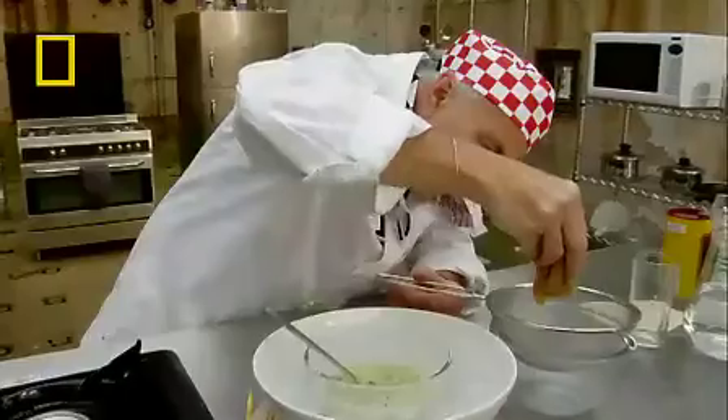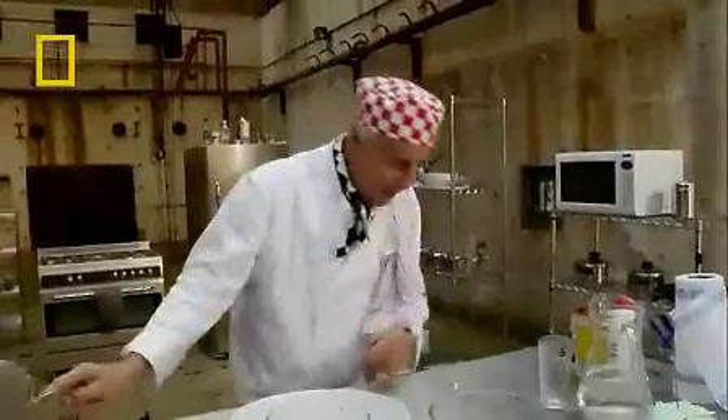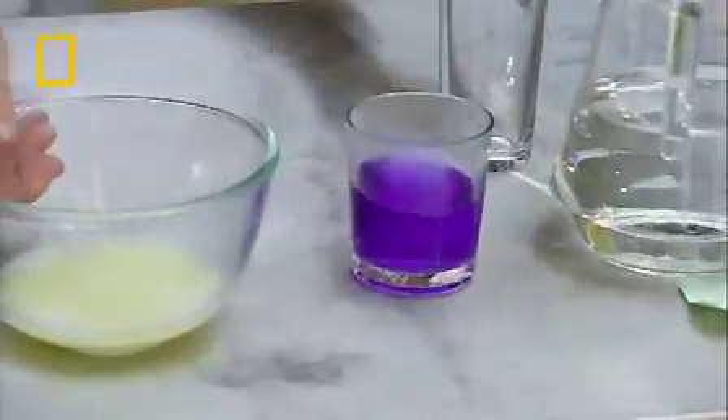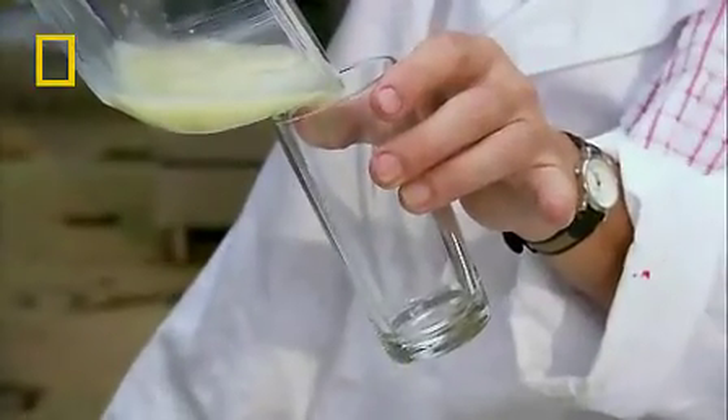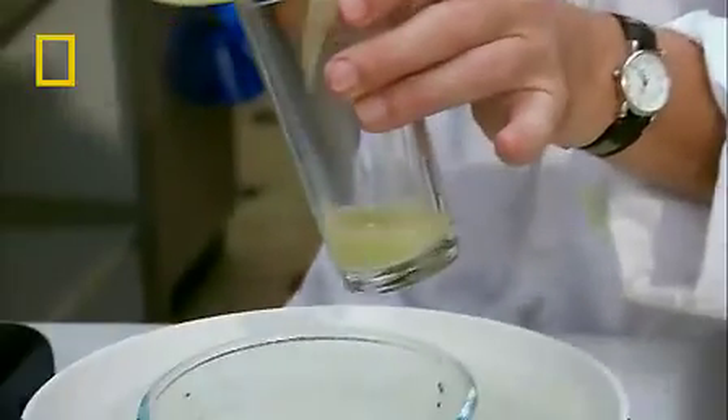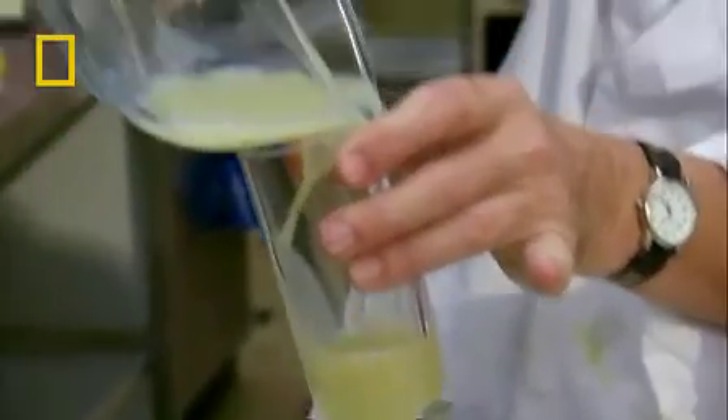Here it is. The DNA has dissolved in the water — kind of cloudy still. There we go, it's coming through. We've got enough there. Now let's just transfer some of this very carefully into this glass. You don't need to pour all of it — about a depth of three centimetres.